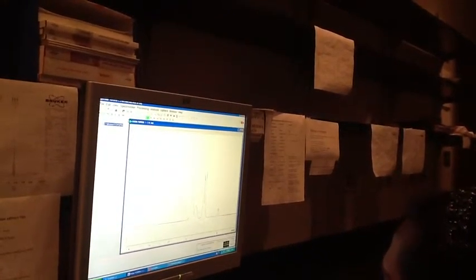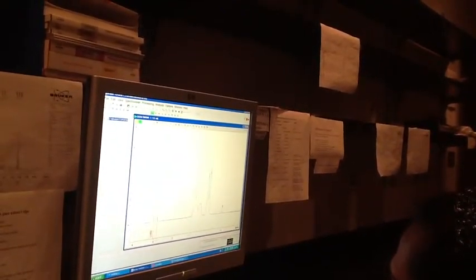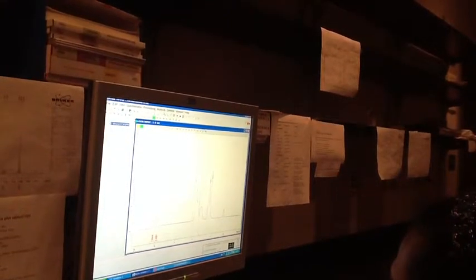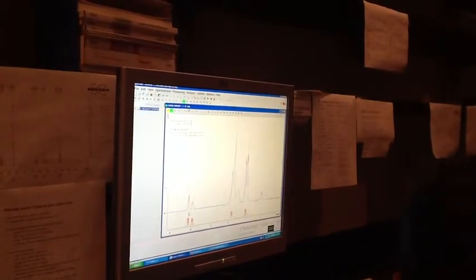Okay, so this is a little bit of a better spectrum. So what should I integrate that peak to? The one next to the most electronegative. So this one, how many hydrogens are there in that region? Which hydrogen is that in my molecule? The one next to the OH. There's no OH. I thought it's the 2-pentanol. Yeah, but you've converted the 2-pentanol to an alkyl halide. Oh, so the OH is bromine. Bromine or Br, whatever. Okay, so next to Br, the same carbon that has Br.